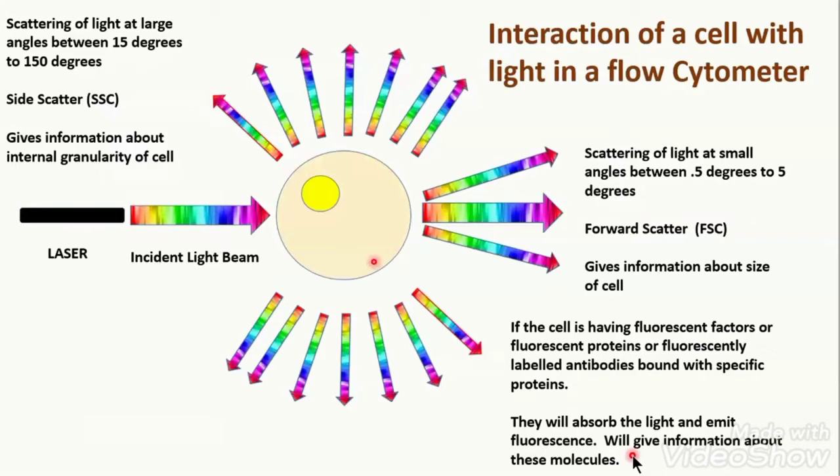And I think in class 11th or 12th, everybody of us has understood that if light is interacting with a solid object, then there can be scattering of light. So a similar thing will be happening here. This light is coming from the laser and this will be scattered by our single cell. Now what happens? That scattering of light can be because of the edges of the cell.